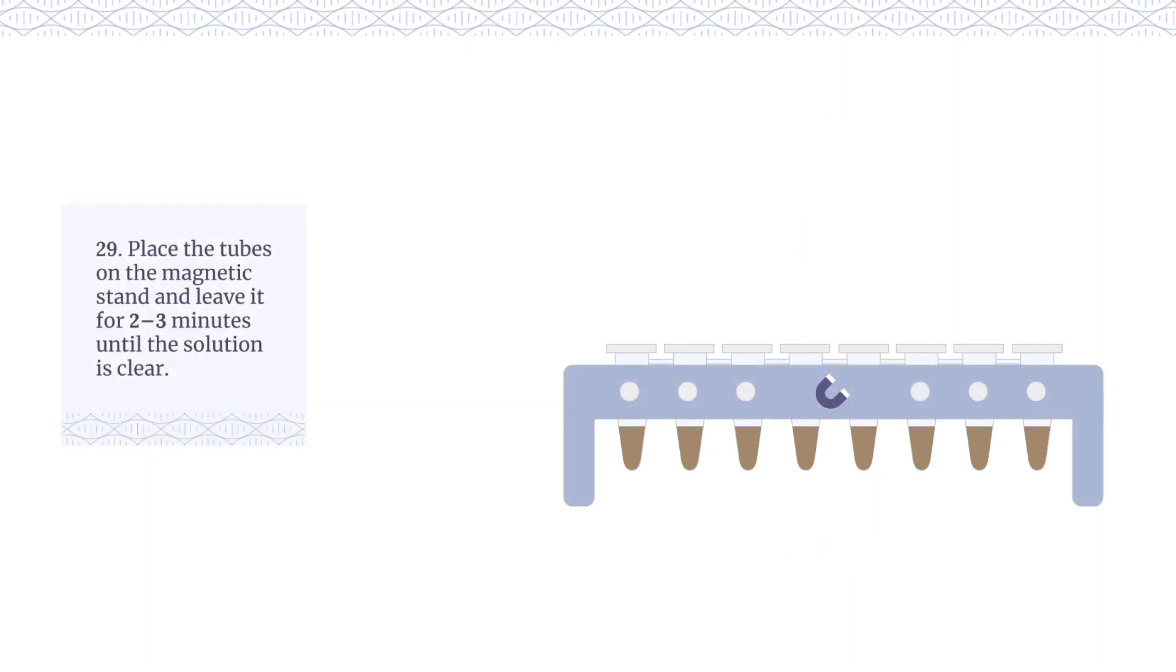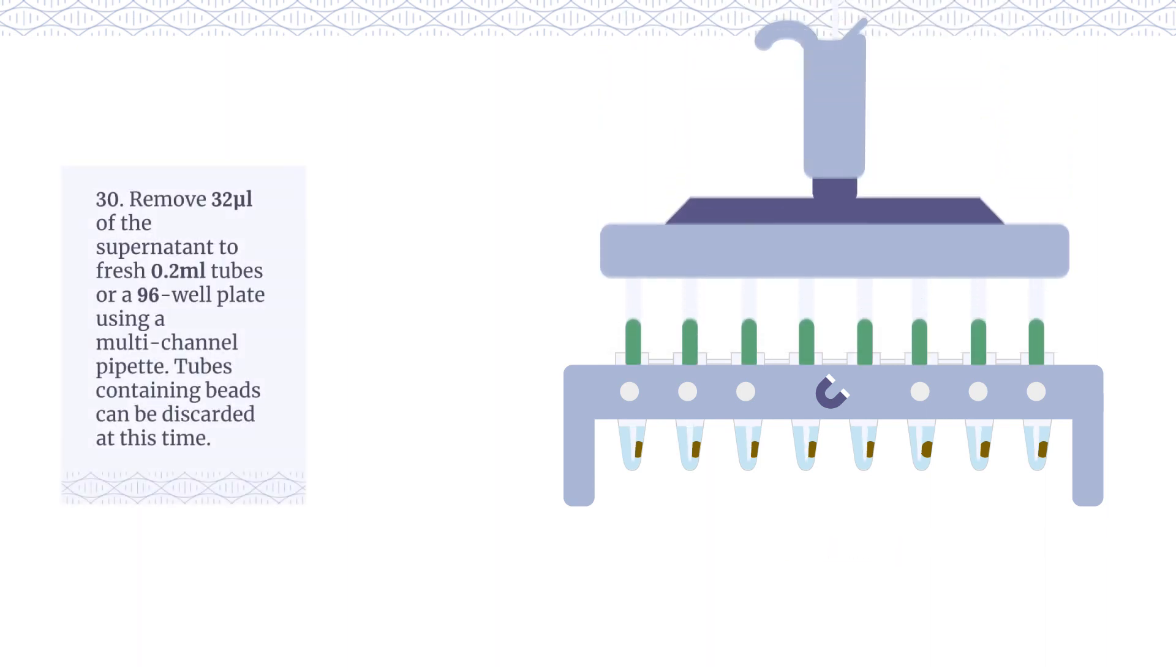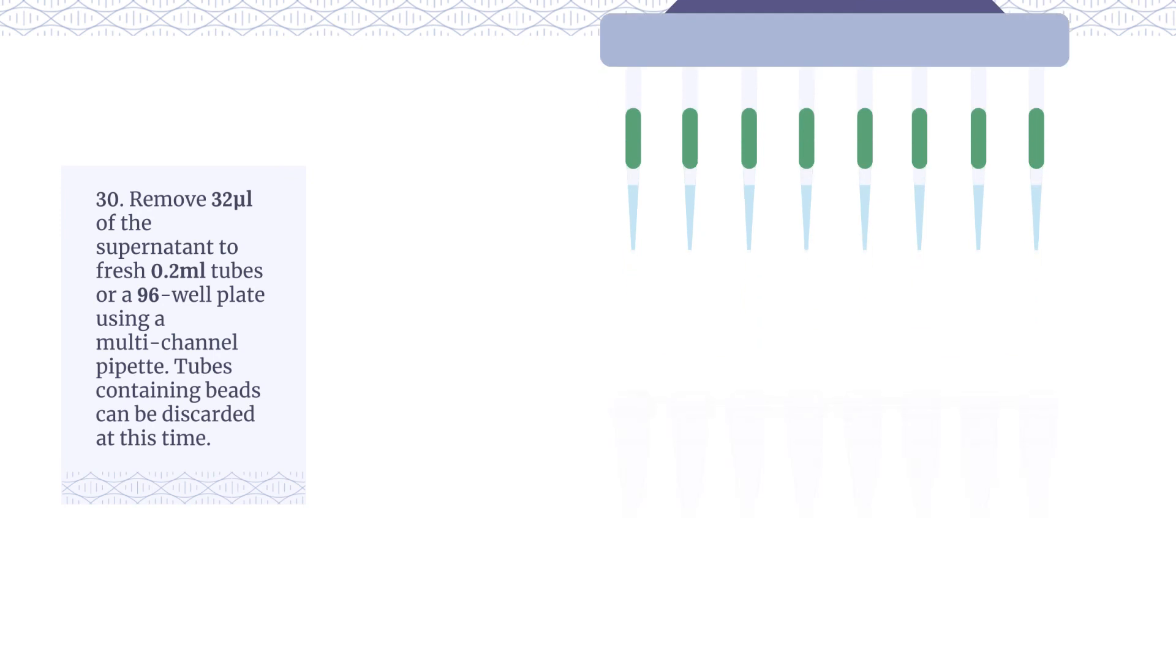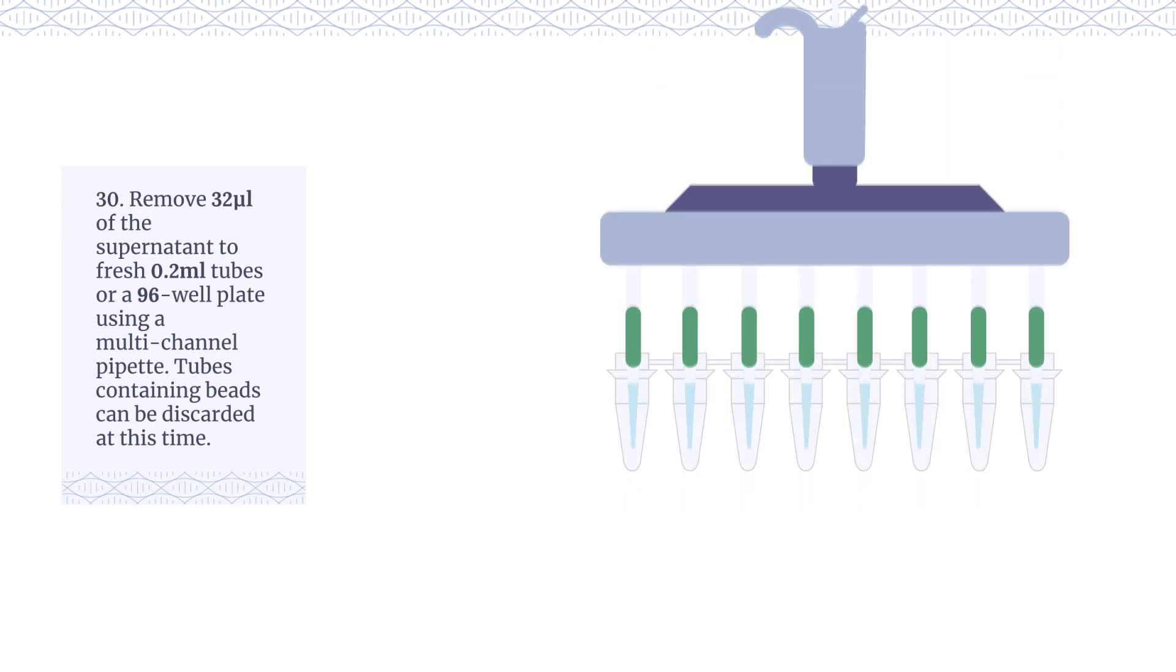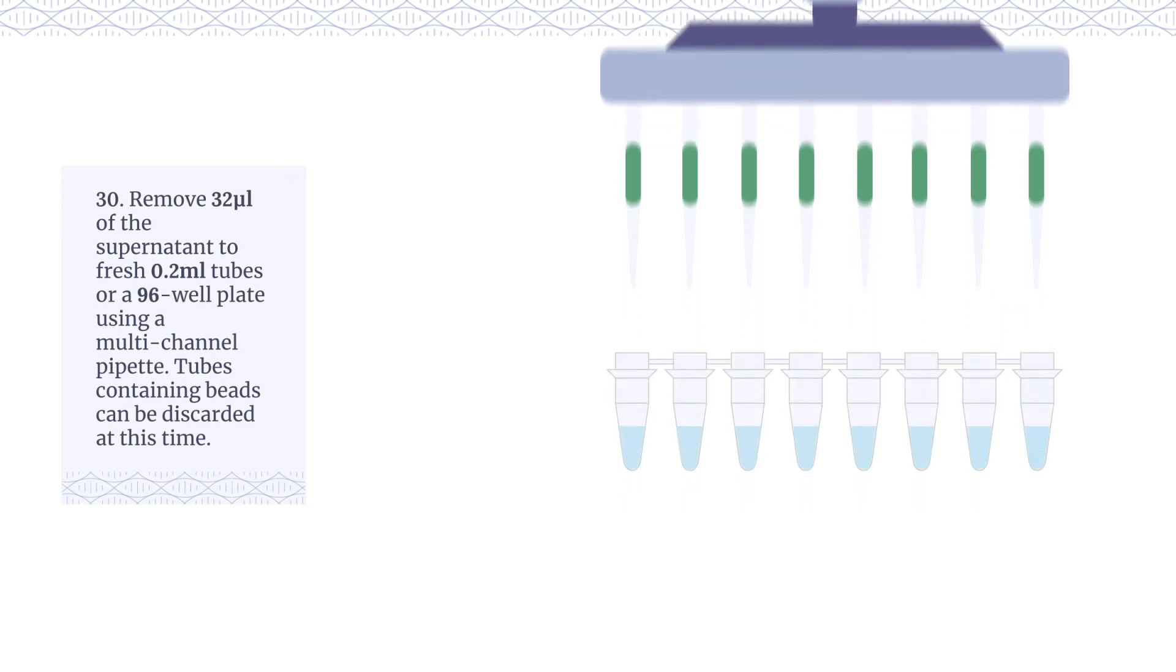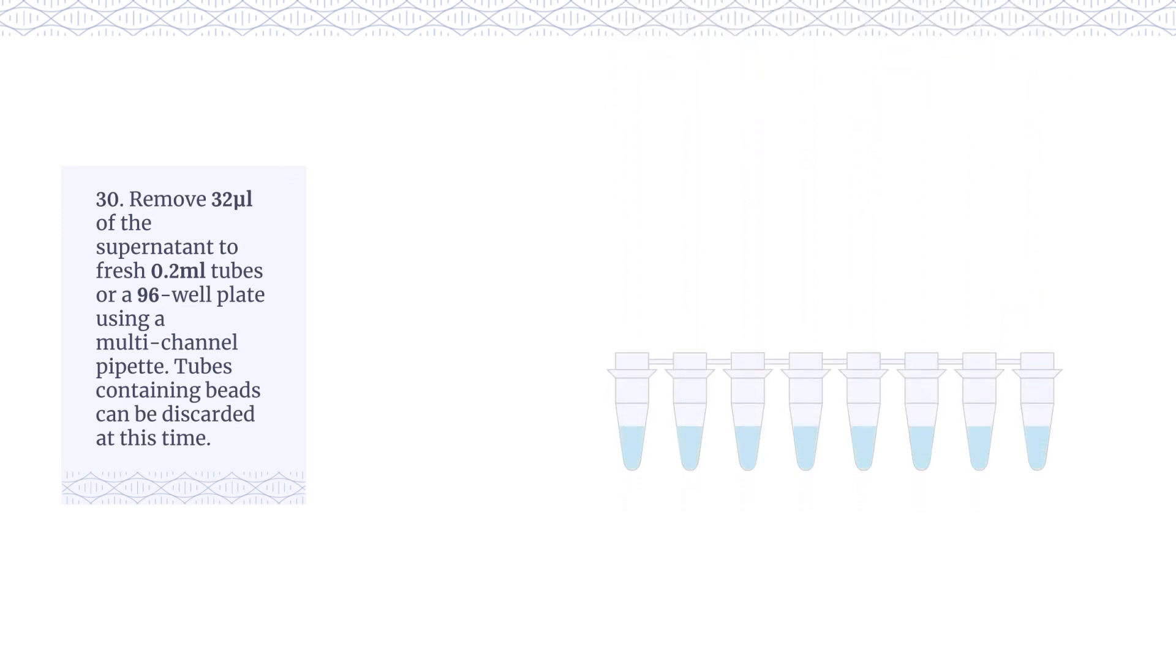Place the tubes on the magnetic stand and leave for 2-3 minutes until the solution is clear. Remove 32 µL of the supernatant to fresh 0.2 milliliter tubes or a 96 well plate using a multi-channel pipette.